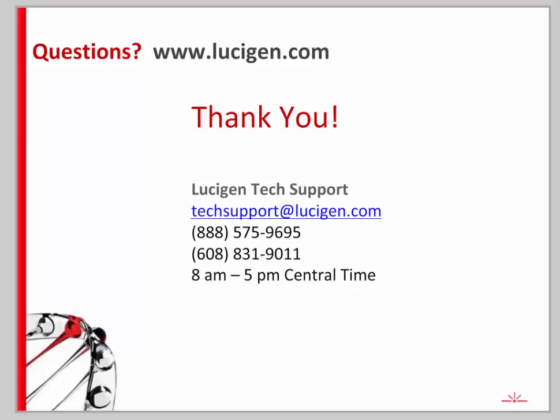All right, question from Fernando. Once transformation has worked on the antibiotic selection media, sequencing of the plasmid reveals it's correct, did not lead to protein expression. So how to troubleshoot that lack of expression if we are sure that the plasmid sequencing results are correct? Is there another expression strain that we could try? Do you have any thoughts on that, Eric?